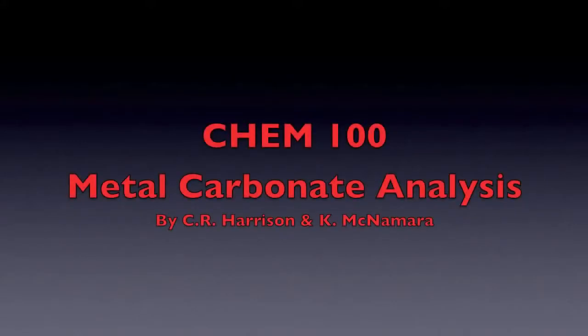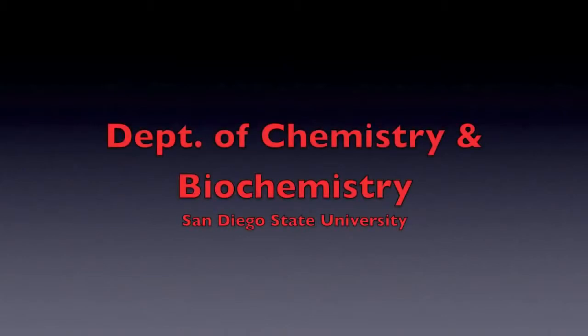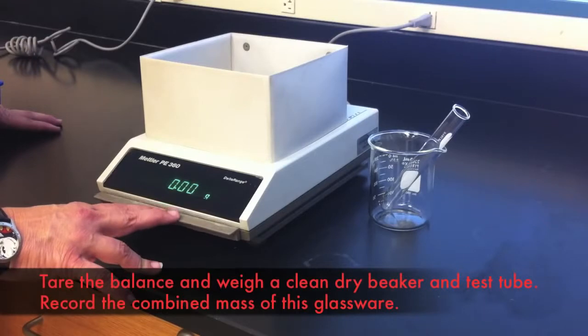In this lab, you'll be looking at the evolution of carbon dioxide gas from metal carbonate solids. This will be done by measuring the mass of the solid before and after reaction with a strong acid.